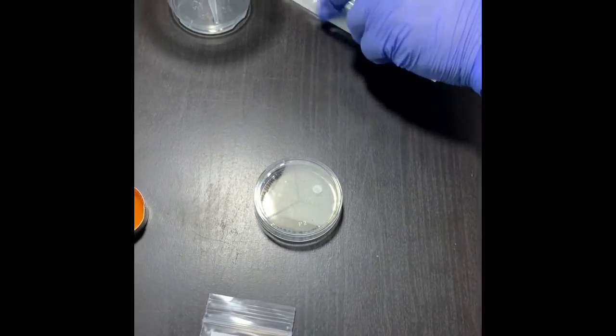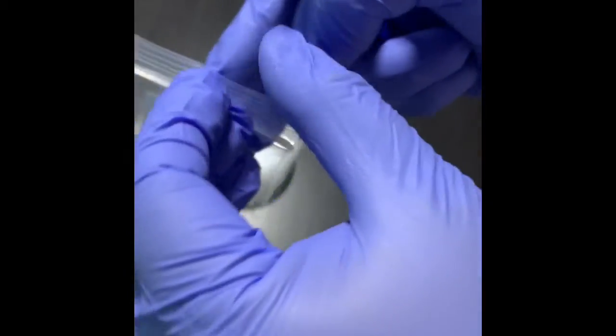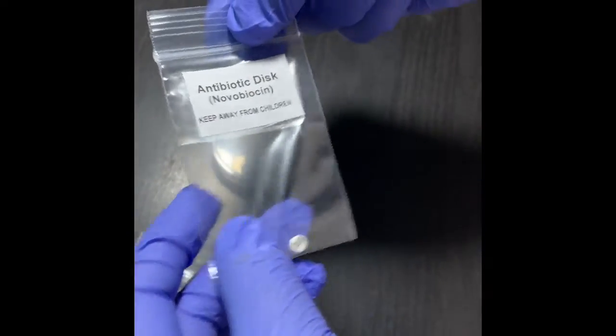I'm going to take my next antibiotic tablet, that is novobiocin.